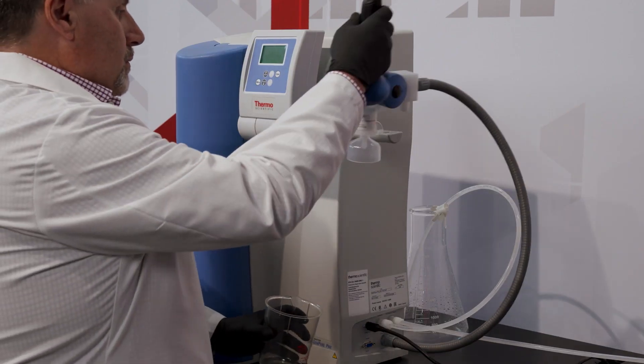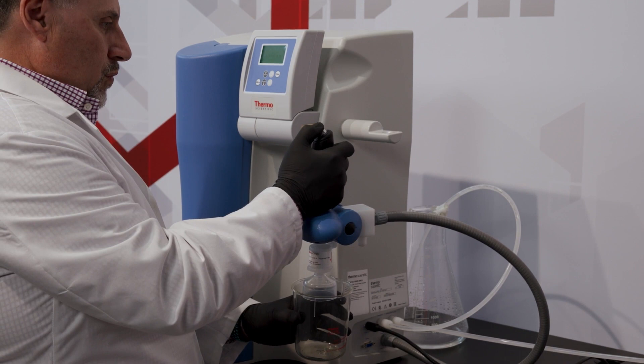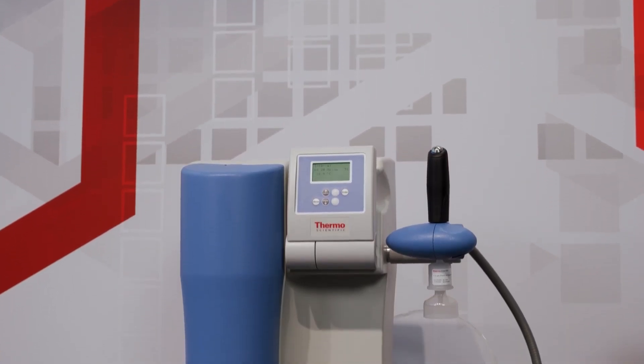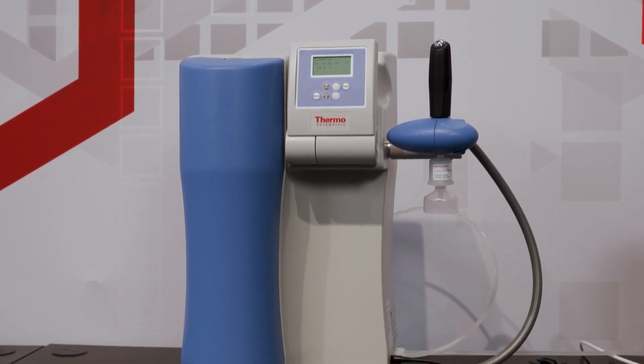Now you'll want to dispense about 20 liters of water to rinse the new UltraPure cartridge. Please discard this water when finished. Once these steps are complete, the system is now ready for use.